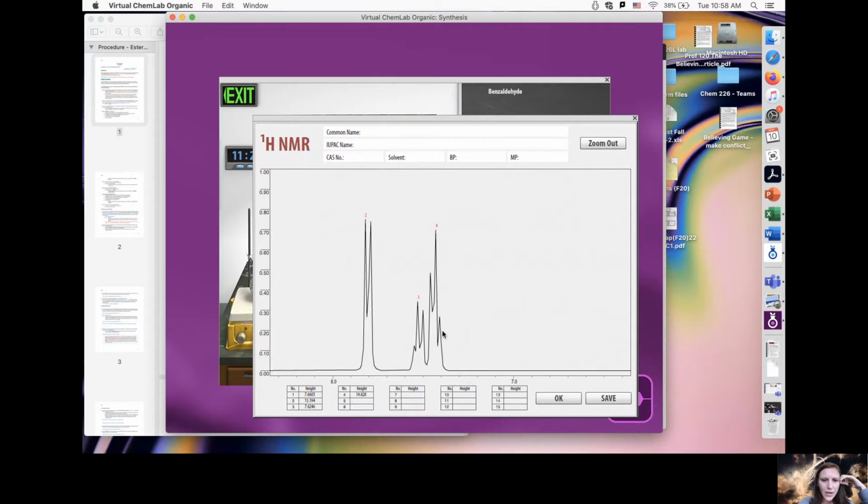So if you look at that, that should only be 1 hydrogen. So it can only be 1 peak. That's how I know from the integration that's 1 hydrogen. So this has to be a triplet. It can't be a doublet because it's too crooked to be a doublet. Okay. So does that kind of make sense?